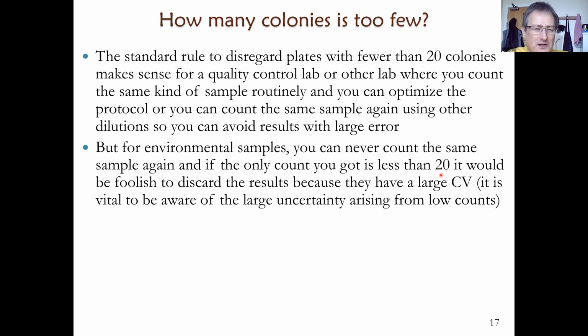If you're doing the arithmetic mean in this case, then we are summing all the numbers here, 1 plus 10 plus 100. So this one here basically has no effect on the arithmetic mean. The 10 has a small effect on the arithmetic mean. You're basically dividing the largest number by 3. So you get a very different result if you're taking the arithmetic mean and the geometric mean. The arithmetic mean is strongly influenced by the largest number if your data ranges over several orders of magnitude.